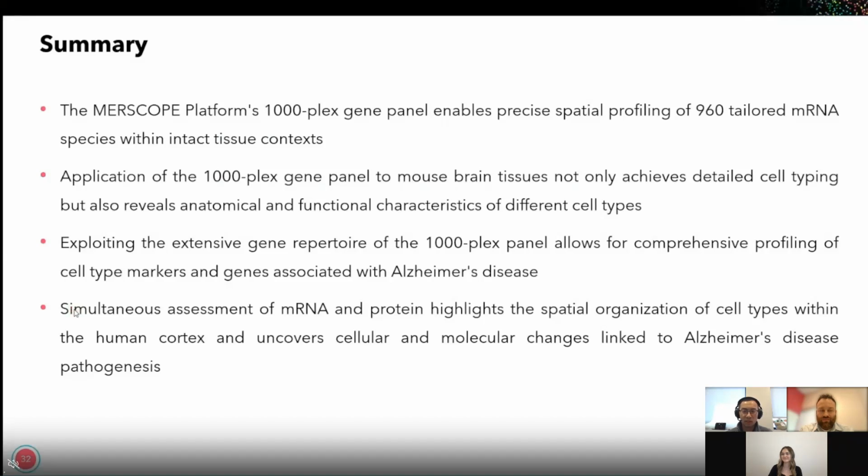I'm going to take this one. For now, we mostly assign the transcripts adjacent to the soma to the segmented cell, because as you know, in the brain, the cell shape is very complex, especially including those axons and dendrites. And the cells, in most cases, are also packed very densely.